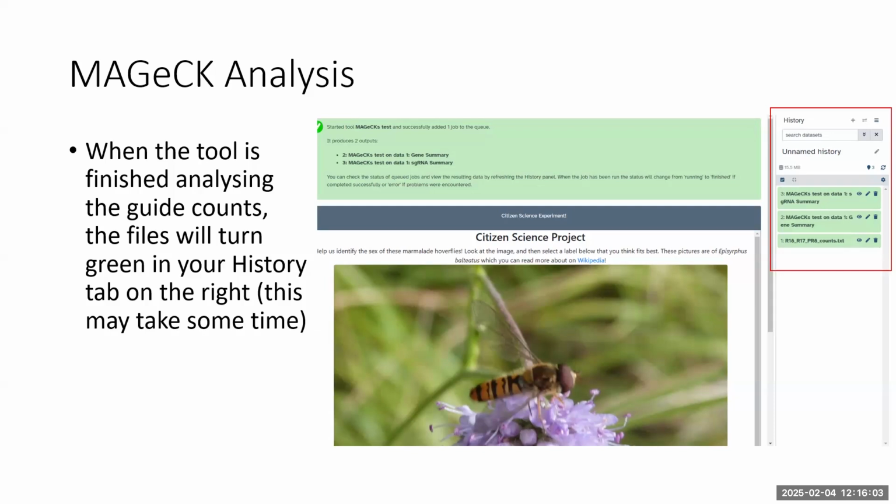You mentioned using one of the already available tools for guide design. Are you required to have a guide design tool that actually supports your genome host of interest? Because for example, you need to manually design guides for trout or shrimp because none of the online platforms have the genome, so you can't check for off-targets or anything like that. You need to check it manually.